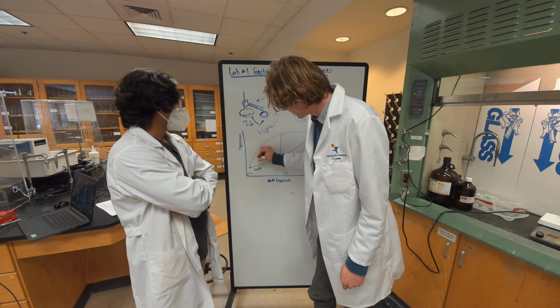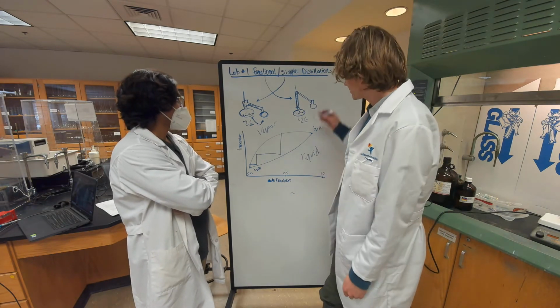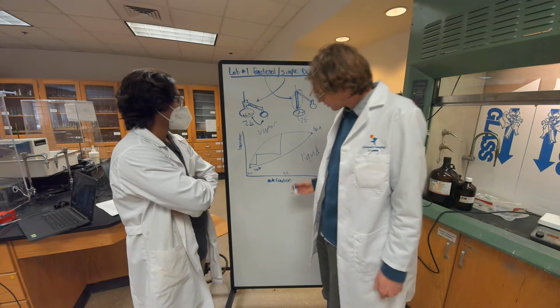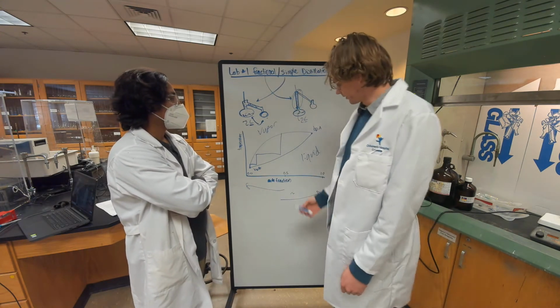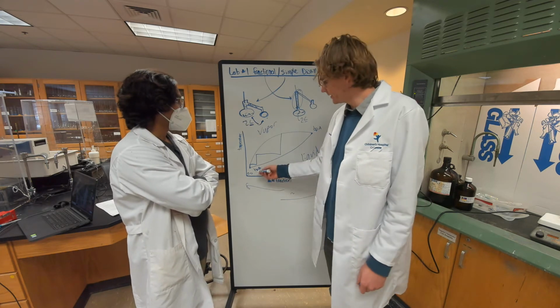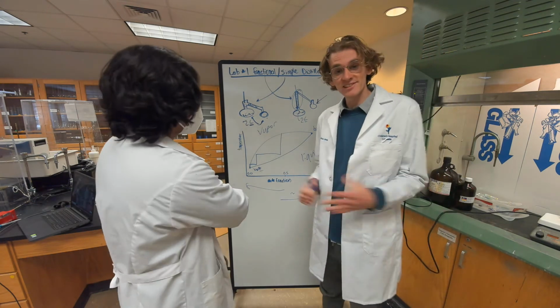So you get a diagram that looks sort of like this, with that being the condensation and that being the vaporization. All of these micro vaporizations and condensations are happening inside the condensing tube, which works to drive the mole fraction towards one side or the other. In our example here, we're driving it towards boiling point B, so we'll be collecting a lot of component B in our collection tube. But you could just as easily send it the other direction. And this is basically what we're doing.